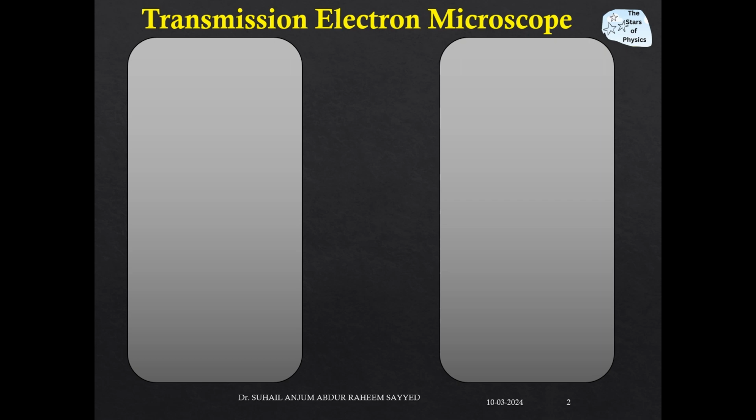So we have a chamber which is evacuated, having a very low pressure, say of the order of 10 raised to power -3 to -4 Pascal, or even better than that. That means even less pressure than that. So it means it has a higher vacuum than that also.